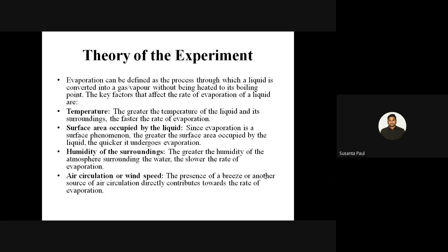So in the film evaporator generally we can use a fairly high temperature, but the exposure time will be very short, so that heat labile substances can be used, or we can make a more concentrated product by taking heat labile substances.